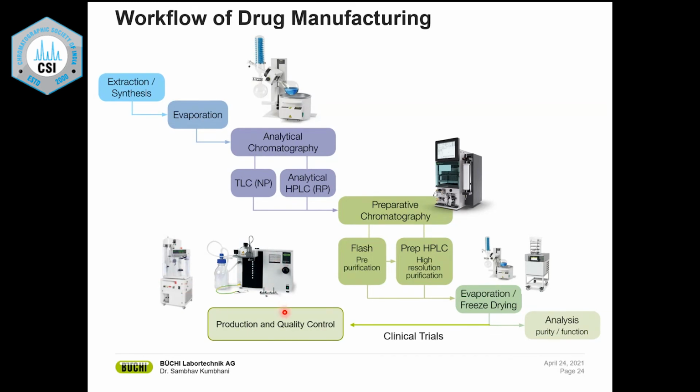So all that happens, and in the QC department also, you constantly check the quality of the product at each step using melting points and NMR and HPLC and other systems. So this is how typically a drug is made, right from conceptualization of a drug to final product.